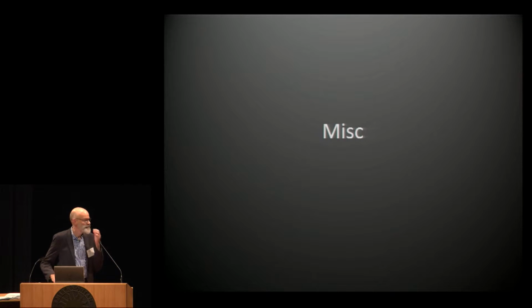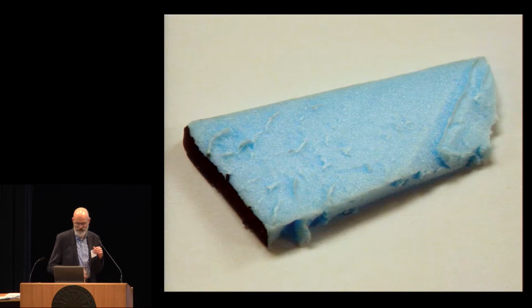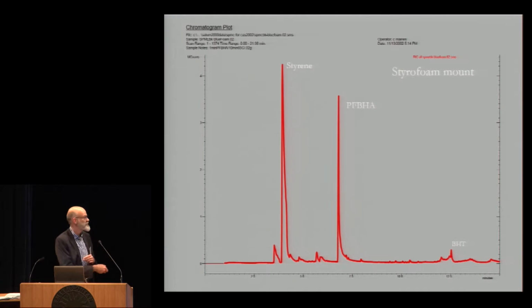So a couple of miscellaneous items. I've talked about these 2 things for years now, and they're both samples from, well, one is actually from NMNH, another acronym, National Museum of Natural History, and the other one is from NMAH, National Museum of American History at the Smithsonian. This was from a diorama at NMNH that was on display for probably 20 years before they took it down, and it was shoved in the back of their lab. So I got a slice of the styrofoam from that and looked at that. At the time I did the test, it was at least 20 years old, probably older styrofoam. And the SPME test shows huge amounts of styrene still being off-gassed from that, and also a measurable amount of BHT coming from that.